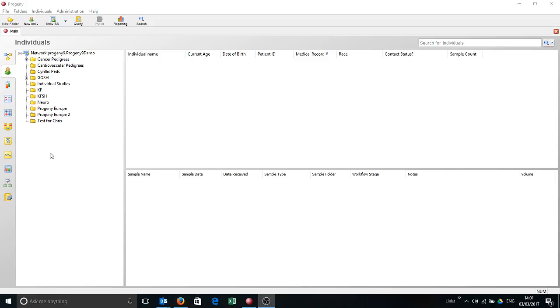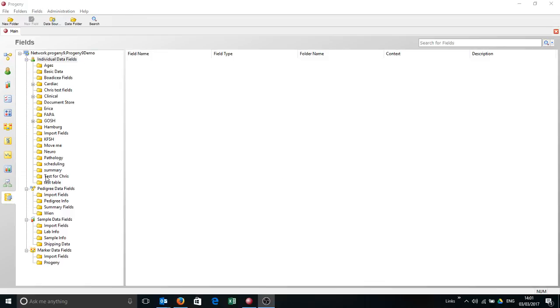So I'm going to show you what I've got in Progeny already. I'm going to use a familiar example. I have my test table here. I've got these 4 values here in the test table. Now one thing you may notice is that these flat fields can also be used as table subfields, and that gives some scope for causing potential problems.